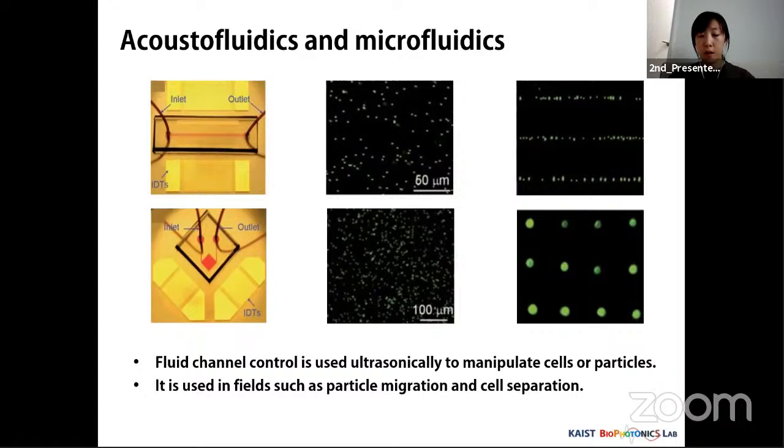Acoustic fluidics is the study and manipulation of acoustic waves using ultrasonic waves in a microfluidic channel. Ultrasonic waves can manipulate micro and nanoliter scale fluid and particles in the fluid.